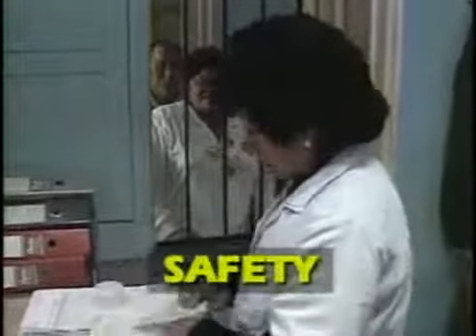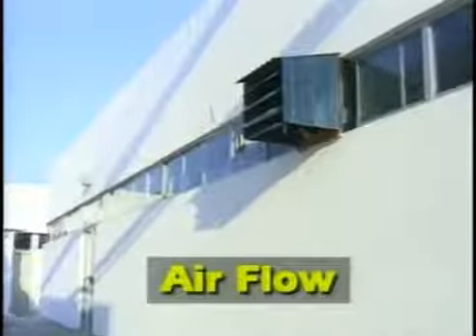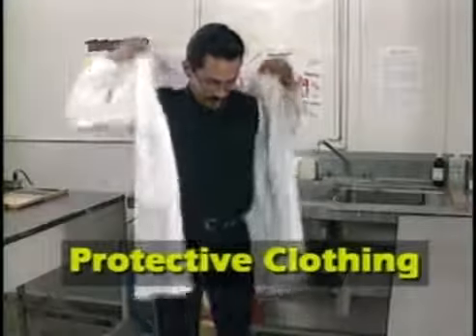washing hands frequently and always before and after performing any procedures, establishing airflow in working areas that will carry infectious particles away from lab personnel. This air should be exhausted into a remote location. Strictly refraining from smoking and eating in the lab. Wearing protective clothing and use of protective equipment. Surgical masks do not protect against TB infection.